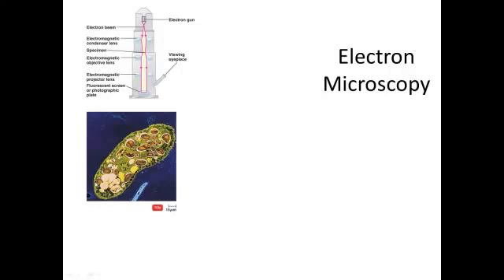Now here, because it's a transmission electron microscope, the beams of electrons are going through the specimen. The specimen has to be very thin, so we make thin sections of the specimen. The electrons go through, and we see the very small internal organelles of the cell. Now, electrons don't have color. That is a function of light that our eyes are able to perceive. So we take a computer and we put the color in because we like color.